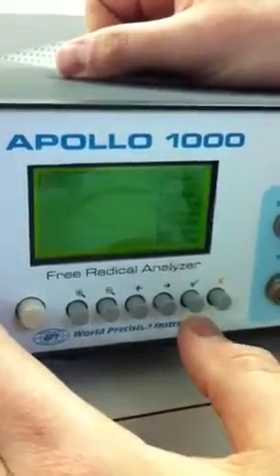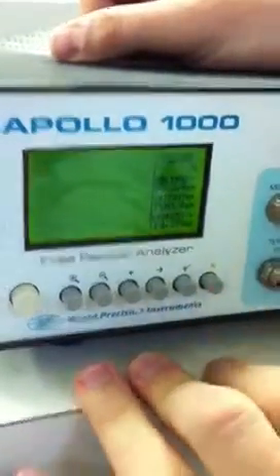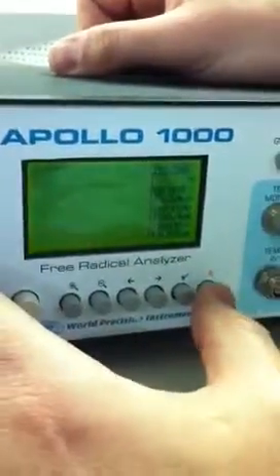and check that. So you don't adjust that with the screwdriver. No, it's a sub-menu that's accessible. Okay, cool.